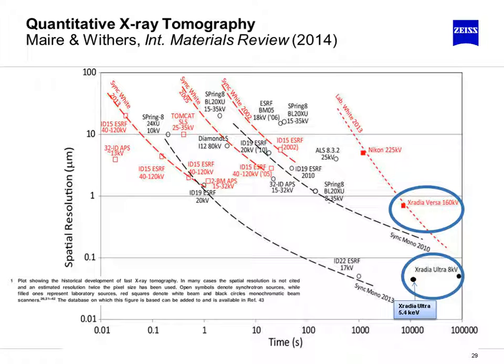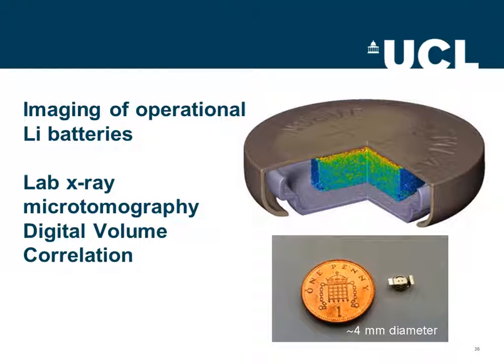And I think the interesting thing here from the application of X-rays to tackle some of these things is sometimes we want to go to a synchrotron because we're interested in very, very fast imaging, sub-second tomography, to capture some of these dynamic events. But often, if we're interested in degradation studies, we need to study the materials and microstructure evolution over many tens, hundreds, and maybe even thousands of hours. The improved availability that we have because we've got these X-ray instruments in our lab means that we can schedule experiments to tackle some of these degradation questions. And I hope I'll be able to show you a few examples of that as we move through today's webinar.